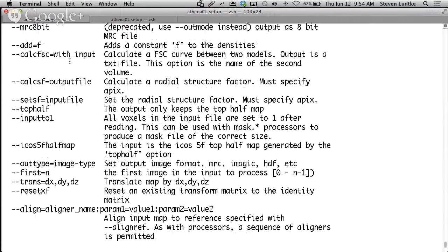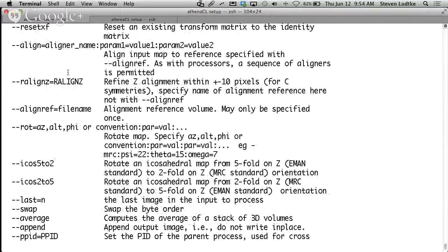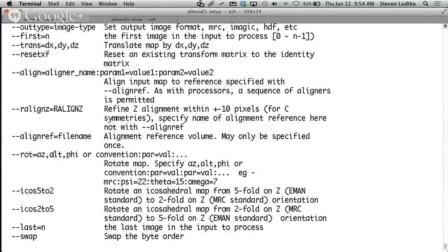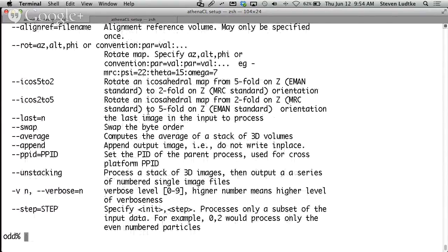Most of these options are the same. Yeah, there are some options for doing 3D alignments. This is just single-step 3D alignments. If you want to do real multi-stage alignments between two 3D volumes, then we have a bunch of single-particle tomography tools for doing that, and some other separate command line programs for doing that kind of thing.